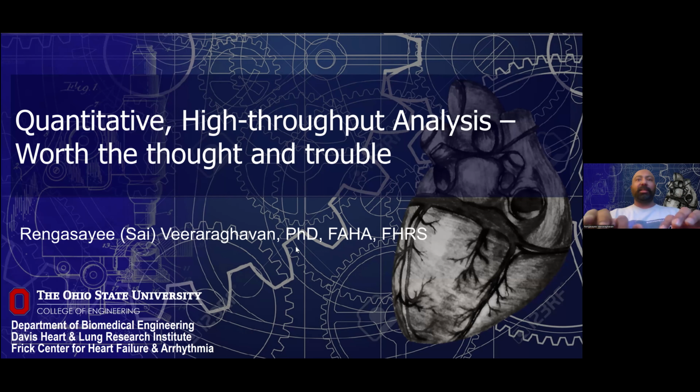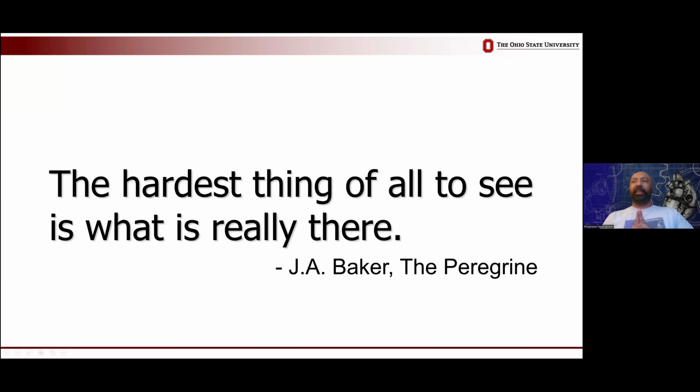I'll start with this very broad quote that I absolutely love from the English naturalist J.A. Baker, that the hardest thing of all to see is what is really there, right? Our senses are terribly limited, which is why we use microscopes and other pieces of hardware to translate reality that we can't access into forms that we can access. But sometimes that means the image from the microscope is not necessarily something I should be eyeballing to make an assessment. This is what mathematics is really for, right?